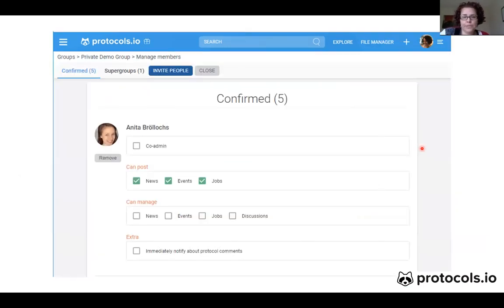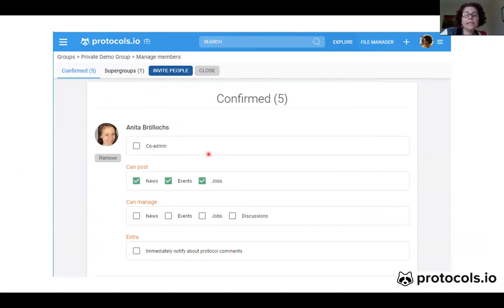If you click Manage Members, once you join your group, you have the ability as an admin to change their roles to either co-admin — so let's say Anita is in this group and I want to make her a co-admin, I will click here — or if you don't click here, they will just be group members.